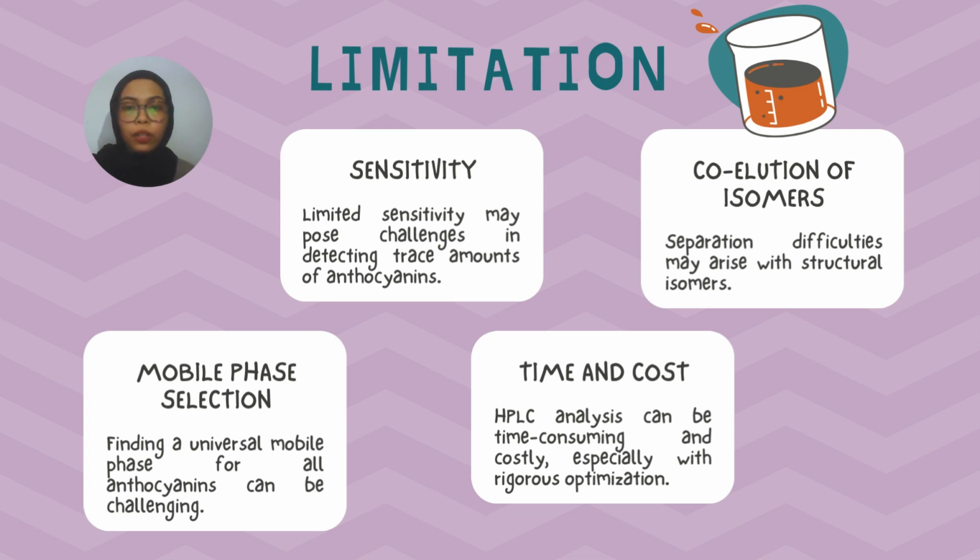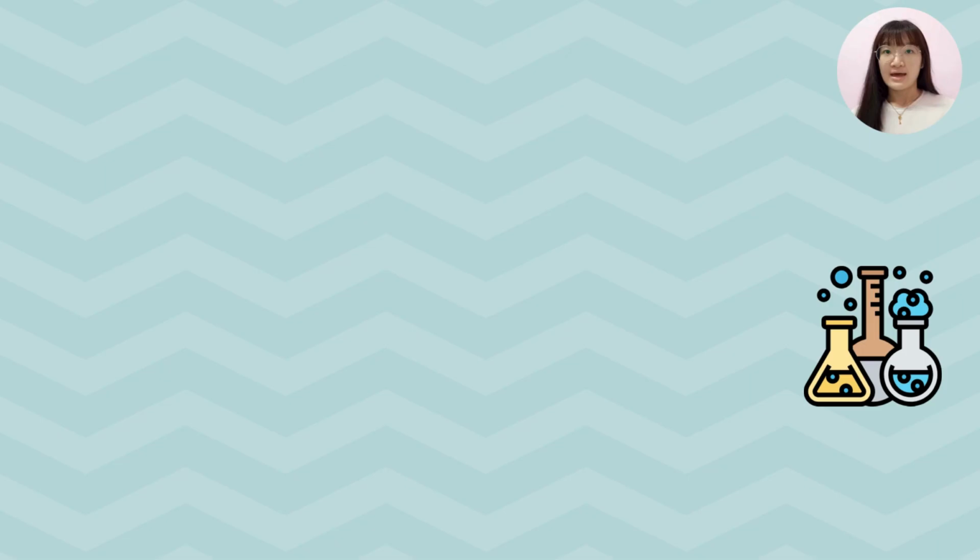The last one is time and cost. HPLC analysis can be time-consuming and also costly, especially with rigorous optimization.